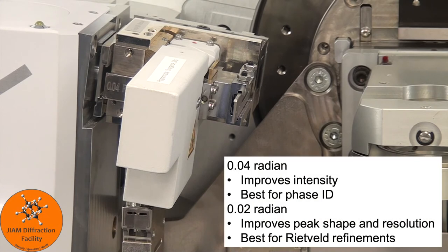And typically, if you are just performing phase identification, I recommend the 0.04 radian slits because they give increased intensity, so you get less noise more quickly. But if you want to perform Rietveld refinements, I recommend the 0.02 radian slits because they give better peak shape and resolution, but it does come at the expense of intensity. So you might have to run your experiment longer.